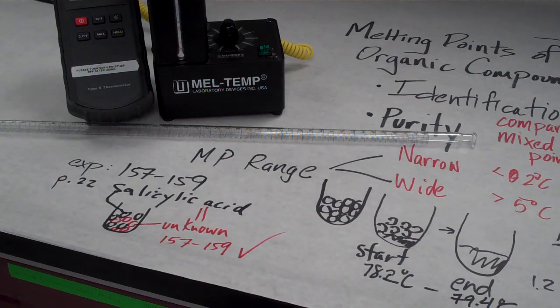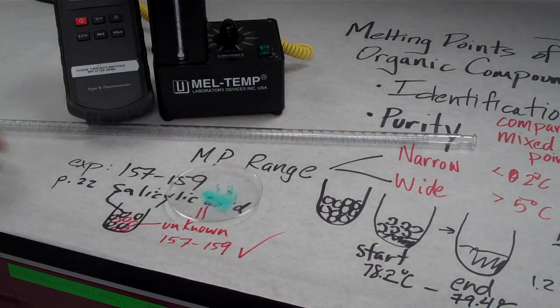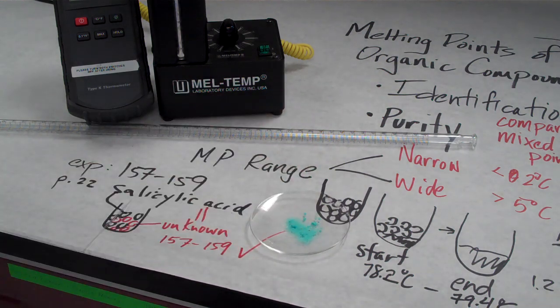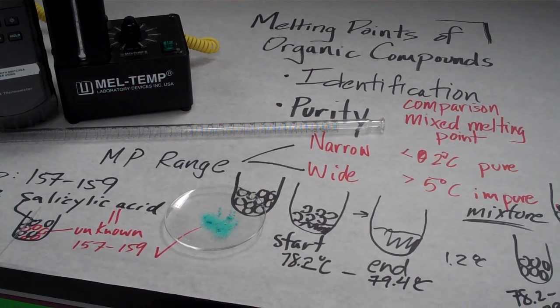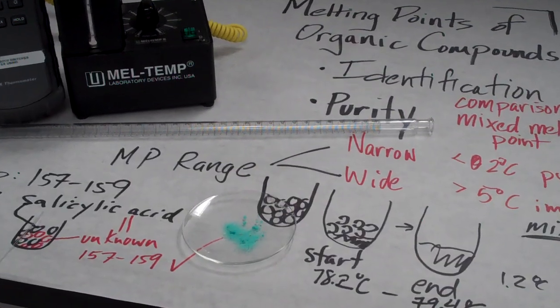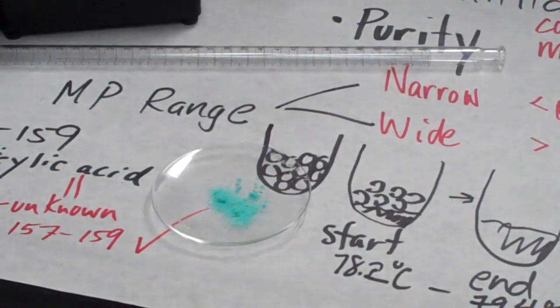Okay. All right, all that's left to do, I think, is to demonstrate how we get our samples into the melting point analyzer. And it's just a little trick that takes some practice. So I've prepared a compound here. Usually we put it onto a watch glass, okay? And that just spreads out our compound a little bit. Whoops, sorry about that.